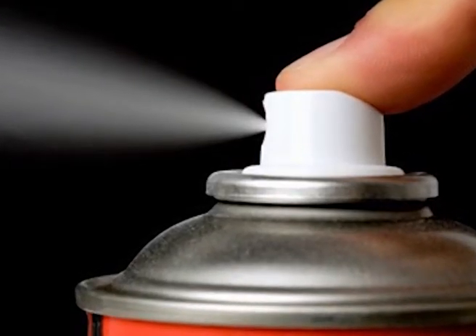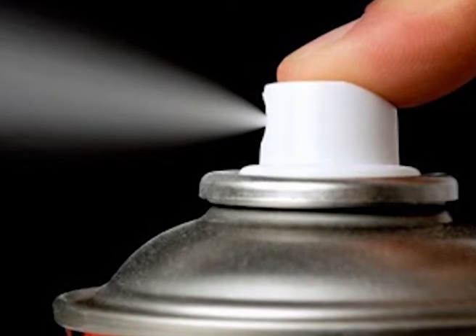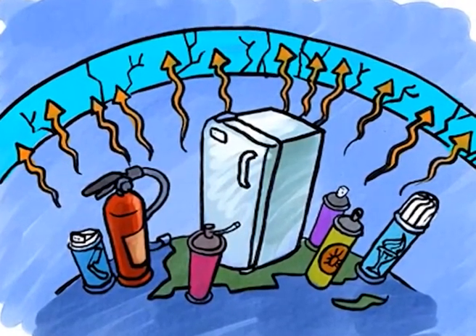As a result of this last characteristic, the freon-based composition has come to be referred to as non-flammable Ninhydrin or NFN. The NFN develops finger marks on a wide range of paper items. It provides a minimal amount of background effects. Moreover, it is effective on surface coated papers such as currency notes as well as the gummed side of postage stamps. It is, however, being feared that it may not be possible to continue with NFN in the years to come.